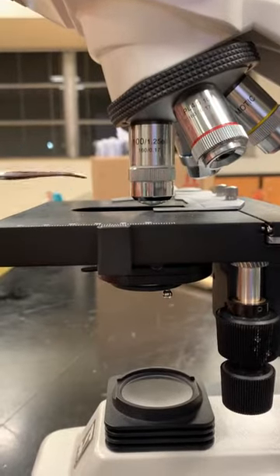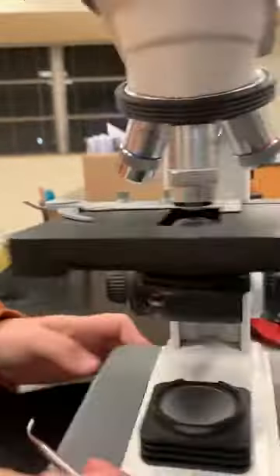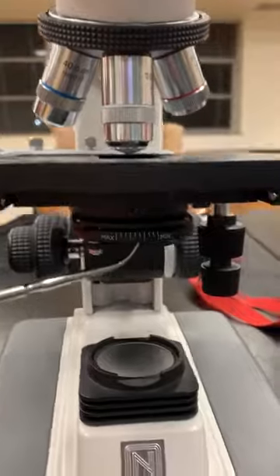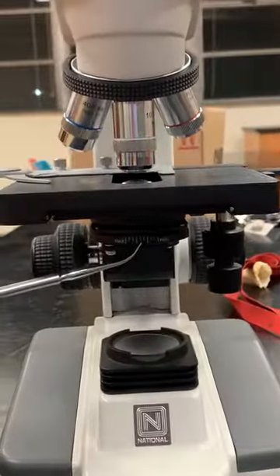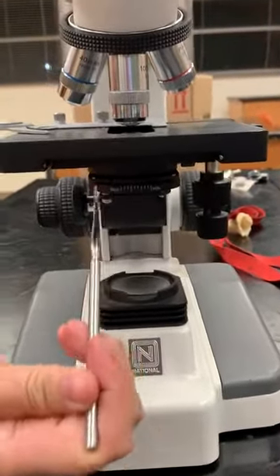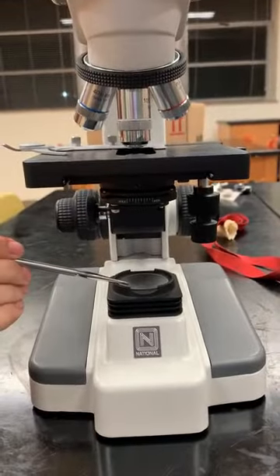The stage is going to hold your slide using the stage clip. The iris diaphragm is going to control the intensity of light that enters into the slide by using this lever where it says min-max. The illuminator is your light source.